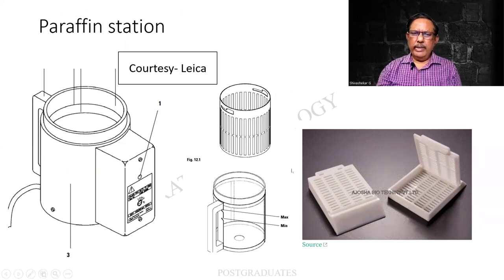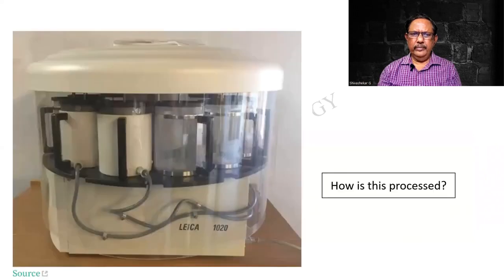So this will be containing the various tissue capsules over here. And this is again the modality by which it can be carried. So this is something that we can very clearly understand. Again, a repetition. So thanks to Leica, from which I have taken a good number of pictures.